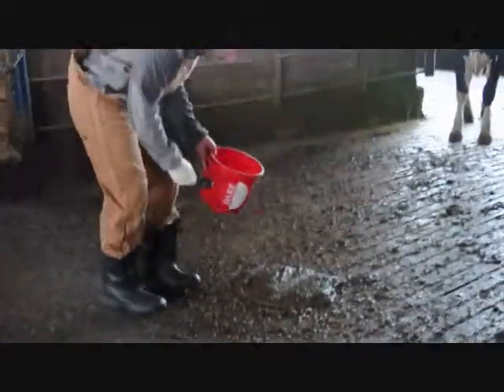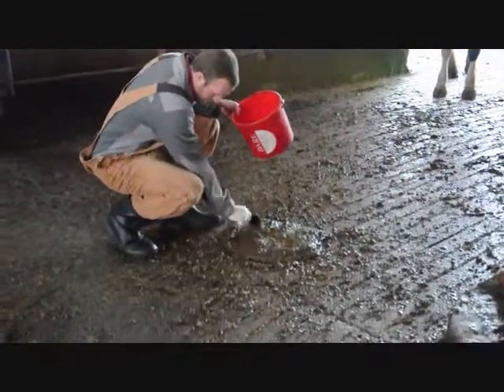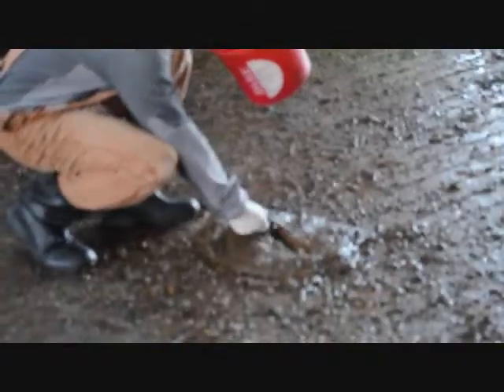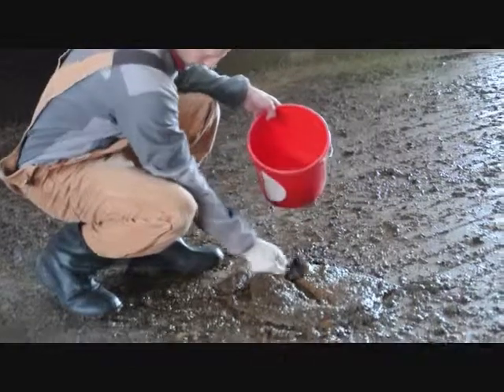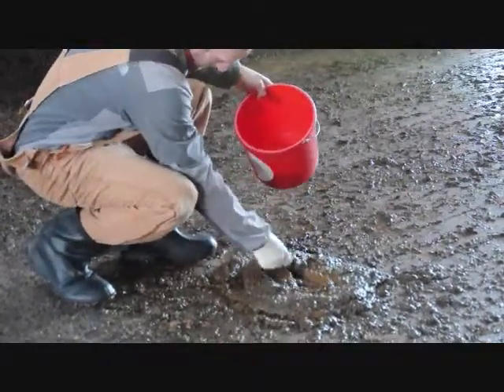We've got an undisturbed pile here, and again what I'll do is just brush away some of the surface where there's some hair, maybe some bird droppings, or other things, and then we'll get our half-cup subsample. I'm going to take two samples from this one just so we can illustrate the mixing and subsampling.